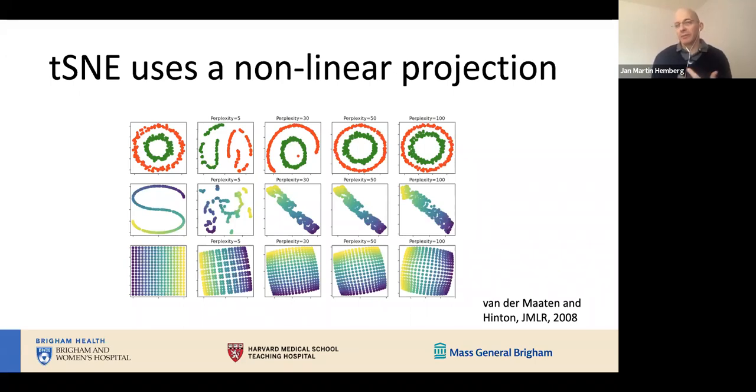What's very important to stress here about t-SNE is that it is really only designed for visualization. You should really not try to do anything with the output beyond looking at it, and not try to interpret things the way you would interpret them using a PCA. But I think, unfortunately, that is not always heeded by people in the field, and I feel people often start discussing t-SNE plots as if they were PCA plots, which is not the right thing to do.